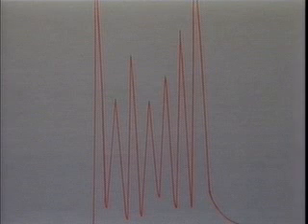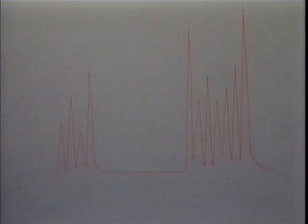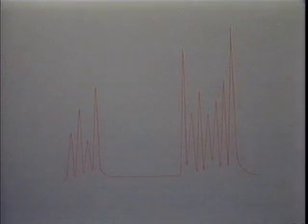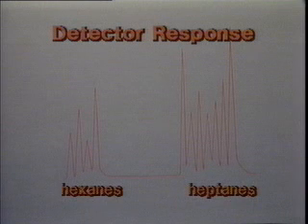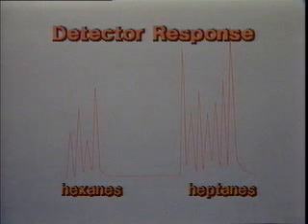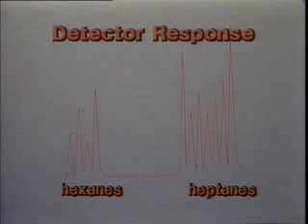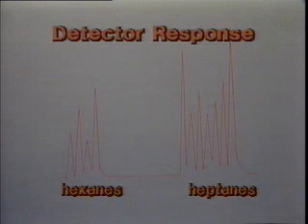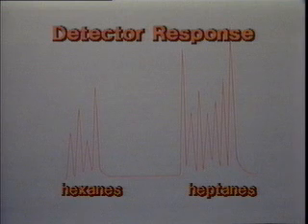The extent of the separation of the components of this sample depends on several factors. The properties of the components of the mixture play an important role in the separation process. In gas chromatography, as in fractional distillation, the greater the difference in boiling points of the components, the easier their separation is to achieve. For many stationary phases, the separation is based entirely on the differences in boiling points of the components. The chromatographic column acts as a fractional distillation column with a very large number of theoretical plates. Components with boiling point differences of only a few tenths of a degree are easily separated.